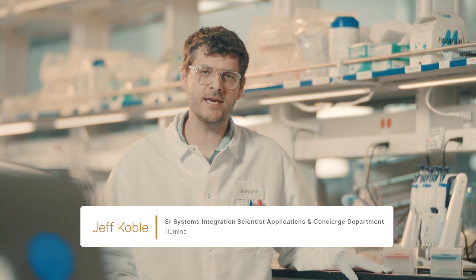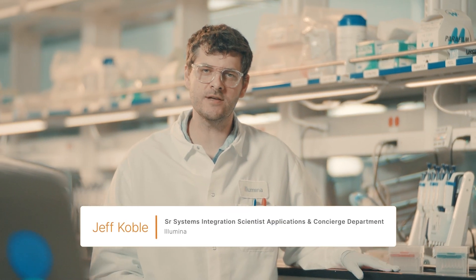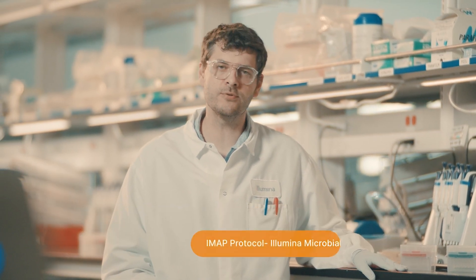Hi, I'm Jeff Koble, and today I'm going to be talking about primer design considerations for the IMAP protocol.